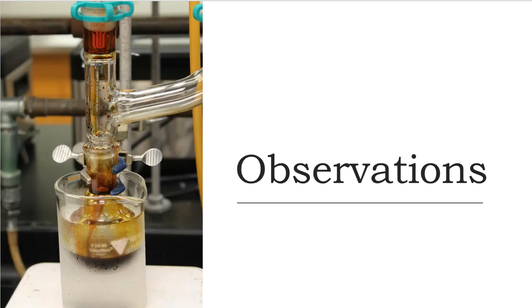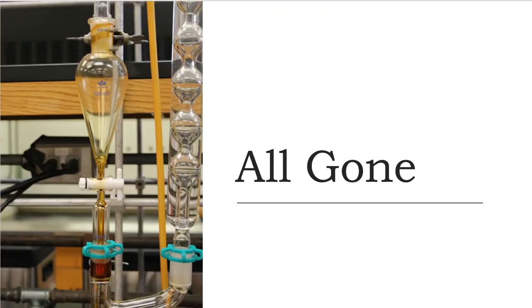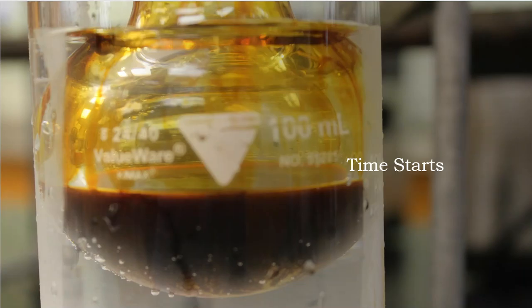All right, so here you can make some observations. This is after my last addition. And then here in the separatory funnel, this proves that it's all gone. You can make your observations there if you want. And now the time starts.